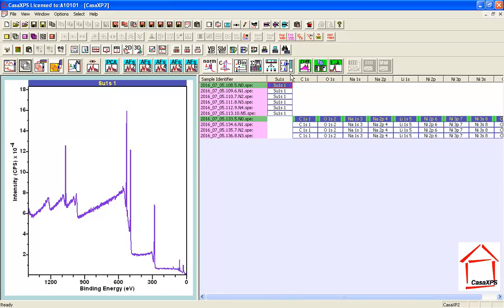But if I adjust the sample identifier so they are identical, then the survey and the high-resolution data will all appear in the same row in this VAMAS file.